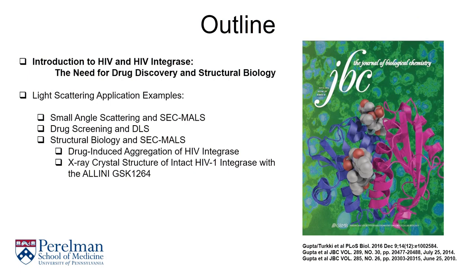Here is an outline for the remainder of my talk today. I'd first like to introduce you to my primary area of research, the enzyme HIV integrase, and the ongoing need for drug discovery and structural study in this area. Then I will proceed to tell you about the situations within our ongoing research where light scattering analysis was key to successful outcomes in the application of another approach.